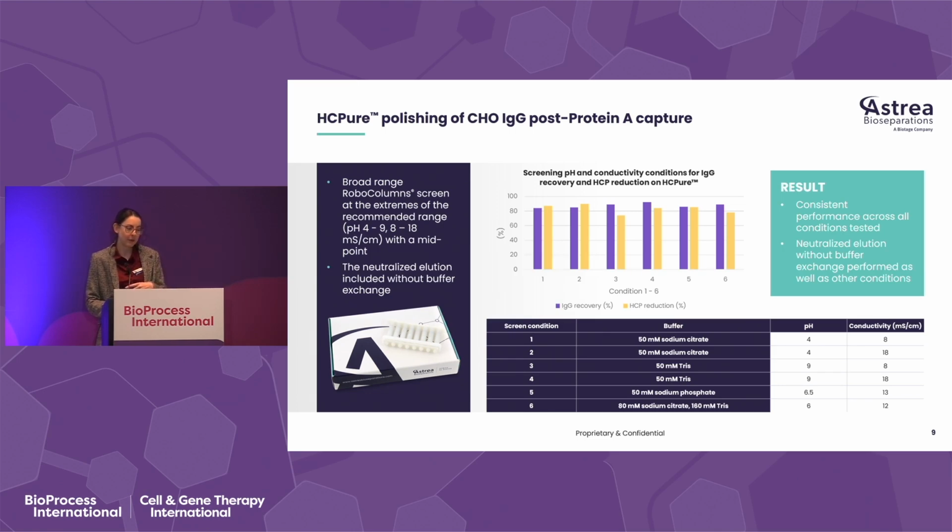In this example, we got really good IgG recovery and HCP clearance across the whole range of the conditions that we tested. That doesn't mean you don't have to do the screen. Every time you have to do the screen, this doesn't always happen. But we decided for this product that we would continue to use just the neutralized solution without having to buffer exchange, as it removed the need to do that buffer exchange step.